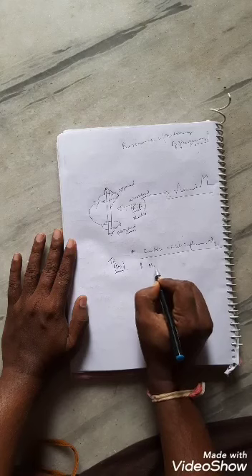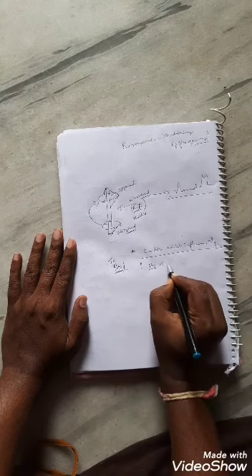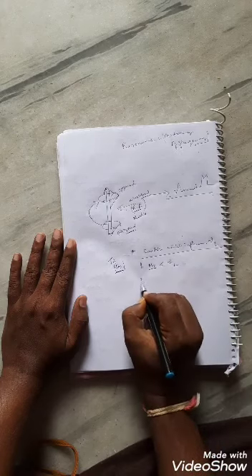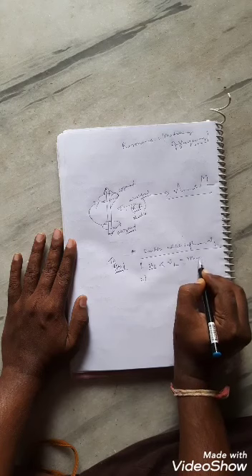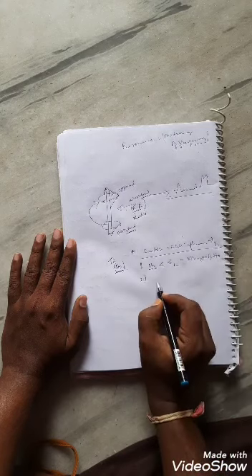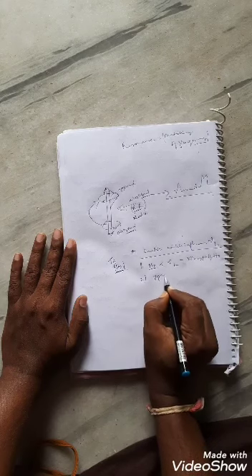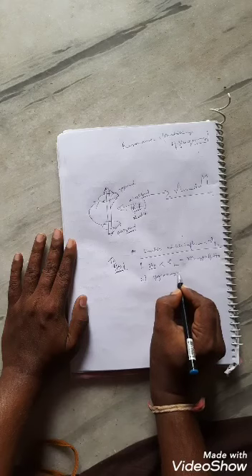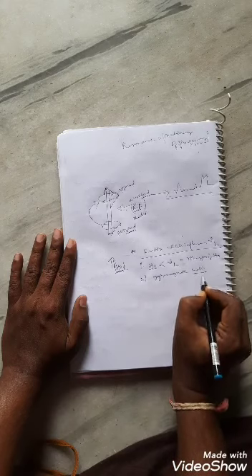Higher the applied external magnetic field, higher will be the precessional frequency. So this is the strength of the applied magnetic field. And another one is the gyromagnetic ratio of the spinning body.